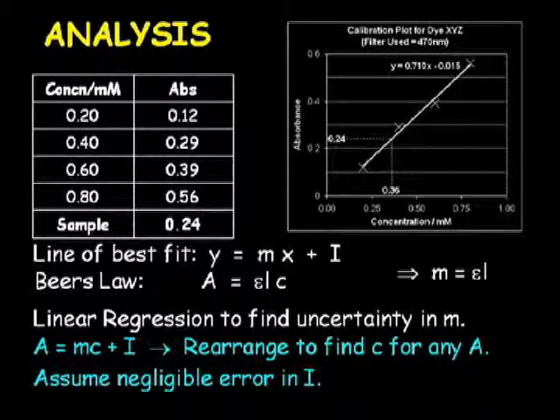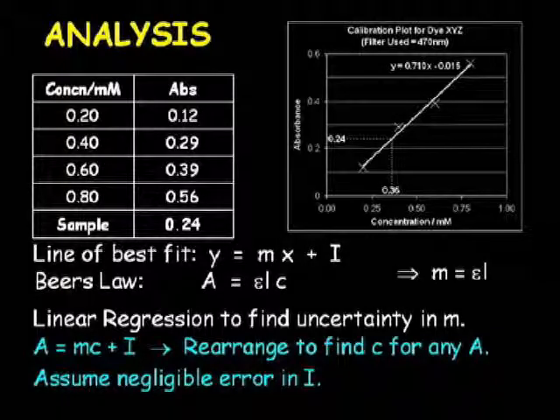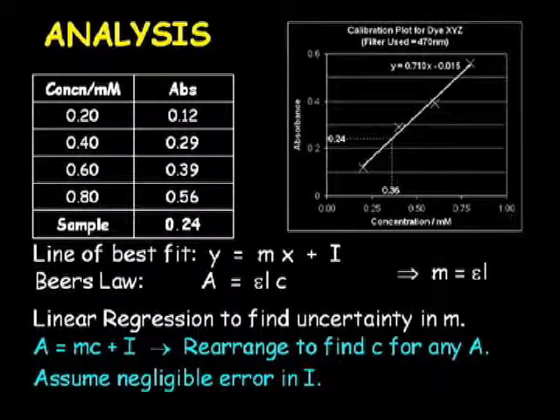This expression will be used to determine the concentration of your cough sweet sample from the absorbance you measured for it. Since all the moles of dye in the solution come from a known number of cough sweets, and since you will be able to determine the molecular weight of the dye used, it will then be possible for you to calculate the average weight of dye per cough sweet.